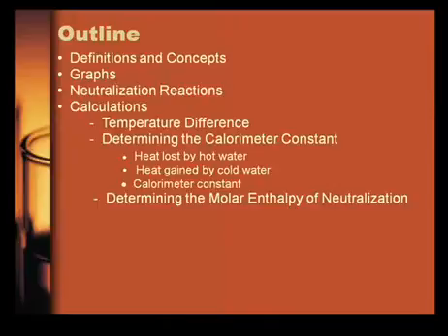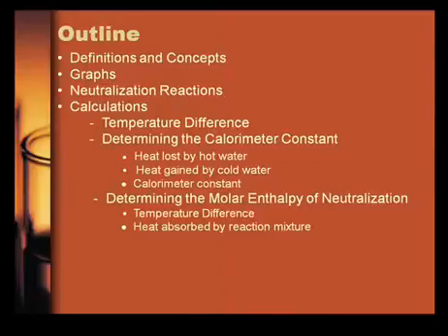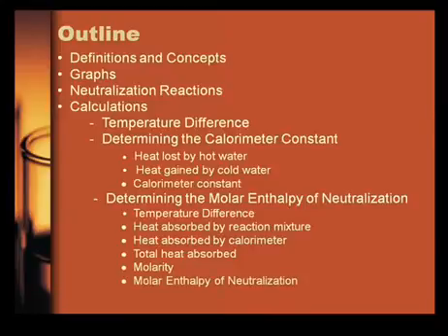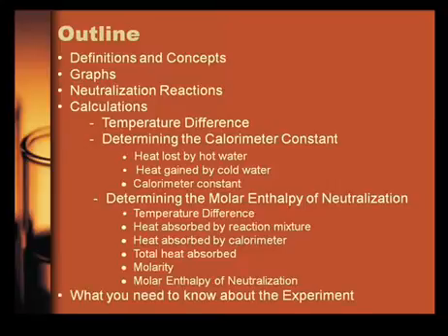Determining the molar enthalpy of neutralization will include temperature difference, heat absorbed by reaction mixture, heat absorbed by the calorimeter, total heat absorbed, molarity, and then all this information going to calculate the molar enthalpy of neutralization. And then finally what you need to know about the experiment.